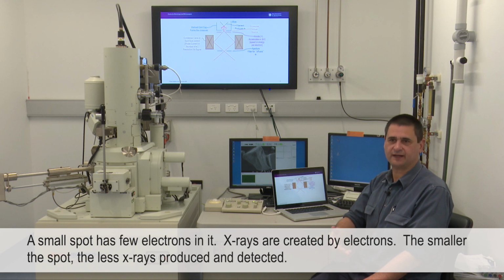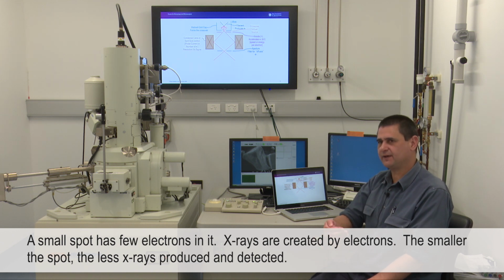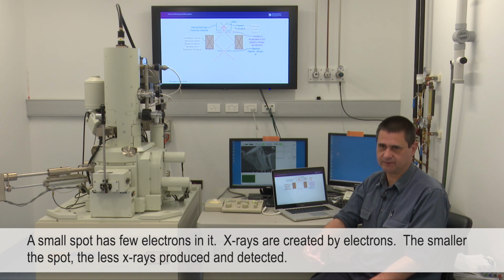But a small spot has very few electrons in it. So for us doing X-ray analysis, the X-rays are created by the electrons. If we don't have many electrons, we don't have many X-rays to measure.